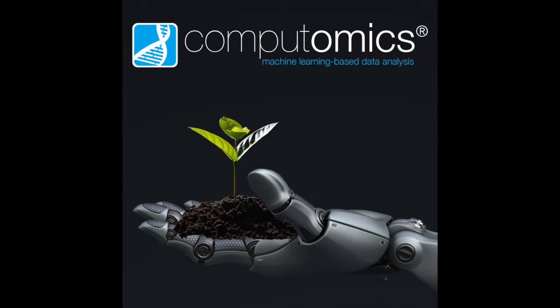Yeah, absolutely. And this would be the way the more experienced metagenomics researcher would interact with us through Morpheus. They would get a reproducible analysis done relatively quickly, and we take care of all the groundwork and the heavy lifting, if you like, and then you can always add more in-depth custom analyses on top. Yeah, that's very cool.